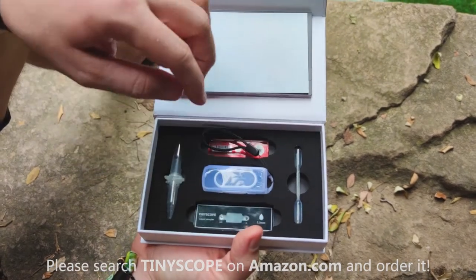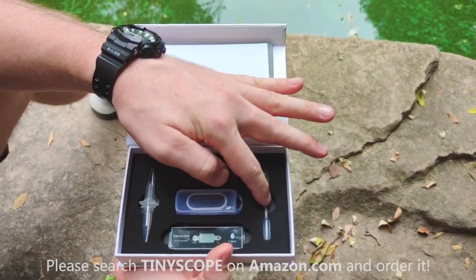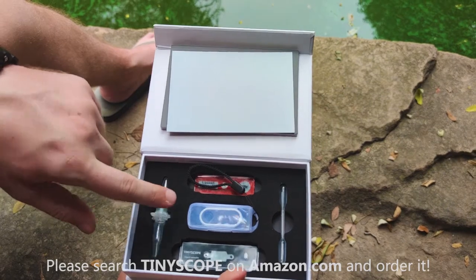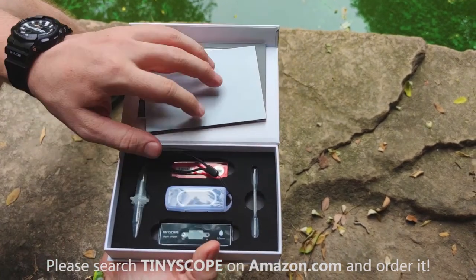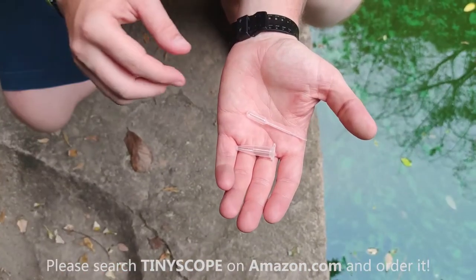Then we've got our Tiny Scope in its little carrying case. The three main pieces of the Explorer's Kit are the pipettes — our little droppers — the liquid sampling slides, and the sampling tubes where you can grab and store a sample while you're on your hike or heading back to the classroom.